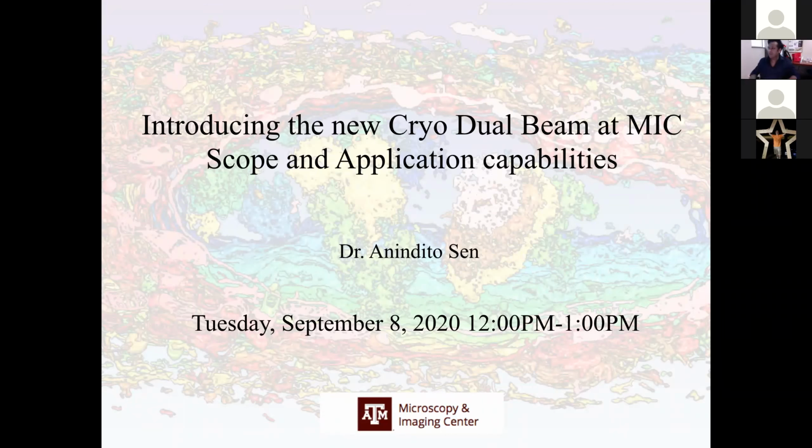Okay. All right. So what we're going to do today is walk over a bunch of slides, which will let us know about the new Cryo Dual Beam, or FIB, as we call it, a focused ion beam SEM. It's a high-end SEM that we are going to have at MIC in the next few months. We will explore the scope of this instrument, the application capabilities, and you can correlate those to how you can use this instrument to enhance your research work and create awesome data.